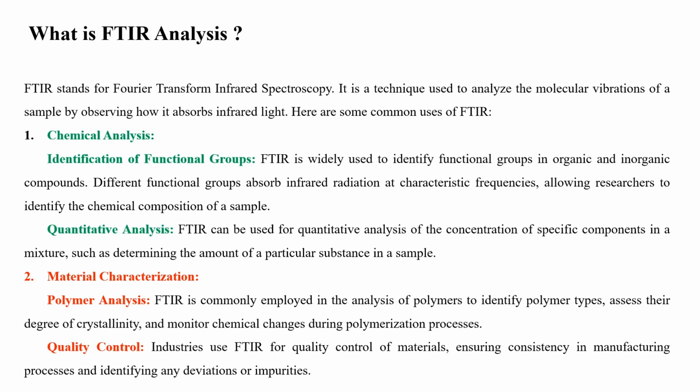Quantitative analysis. FTIR can be used for quantitative analysis of the concentration of specific components in a mixture, such as determining the amount of a particular substance in a sample.